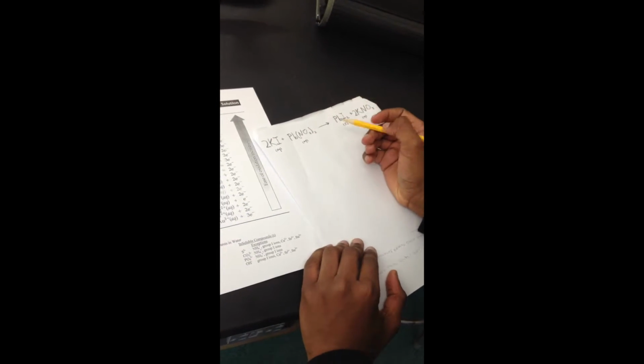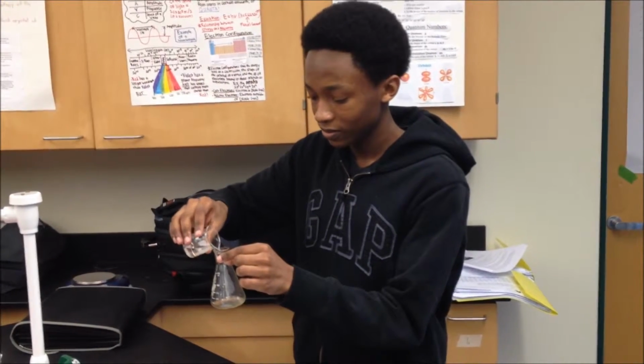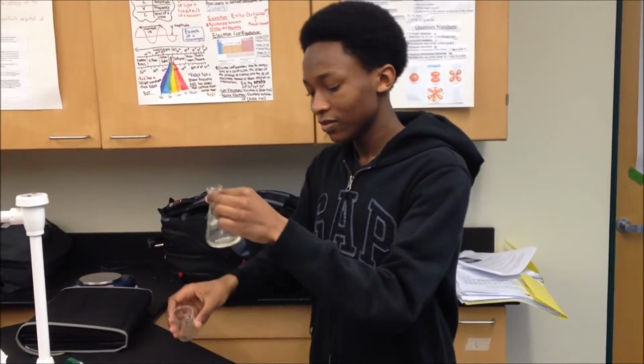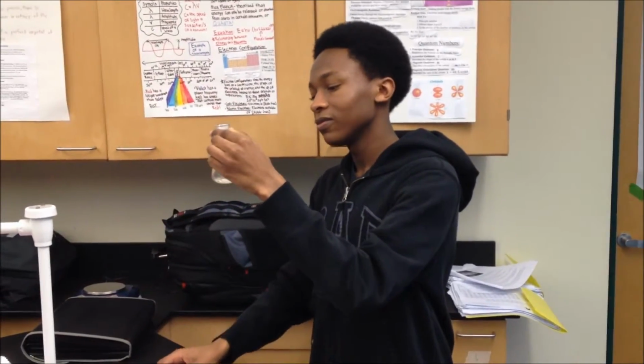Using his knowledge of solubility, Gideon combined the unknown chemical with a known chemical to establish that the murder weapon was in fact potassium iodide. Gideon established this by combining a known lead(II) nitrate solution with the murder weapon. Following the balanced chemical equation, 2 potassium iodide solution plus lead(II) nitrate solution yields lead iodide precipitate and potassium nitrate solution. However, that wasn't enough to solve the case just yet.